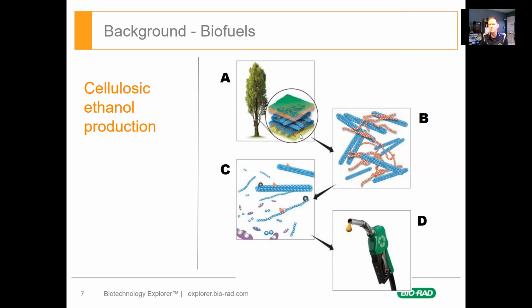So if we can get the cellulose out of the bulk material from picture A, we go to picture B, then we have maybe pulp, all right, broken down wood and plant and leaf matter that's loaded with cellulose plus other materials that can affect our reactions. We want to get the cellulose out permanently if we can. All right, so we have to extract that out.